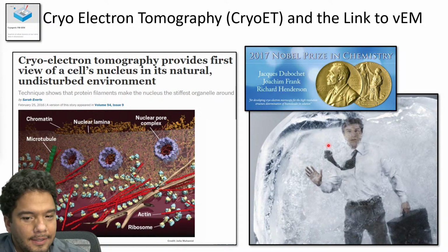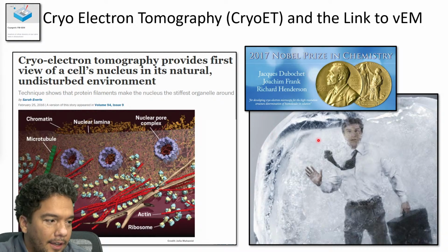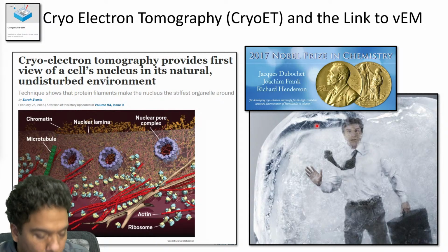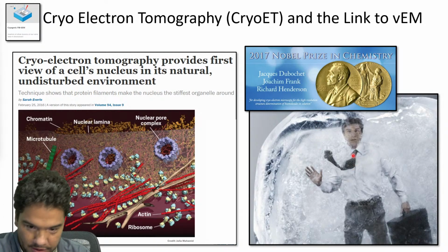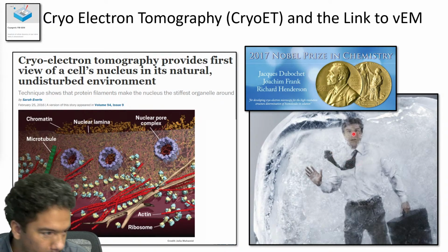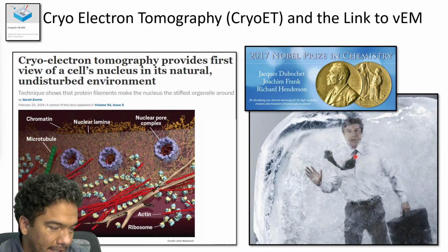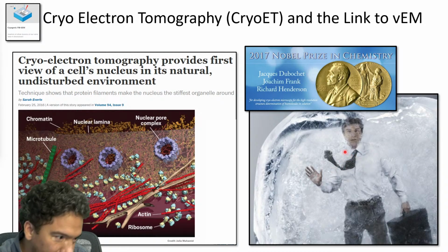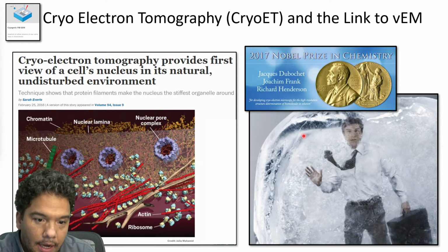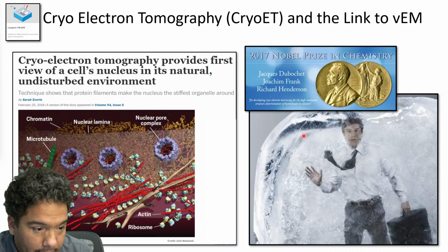This cartoon is really nice. You can get the information at that specific moment and see what is happening with the cells or your sample. For example, this guy here was caught in a windy moment, because it was frozen at that moment. The important thing is that you don't want to disturb that specific moment, and this is the technique that allows you to get that kind of information.